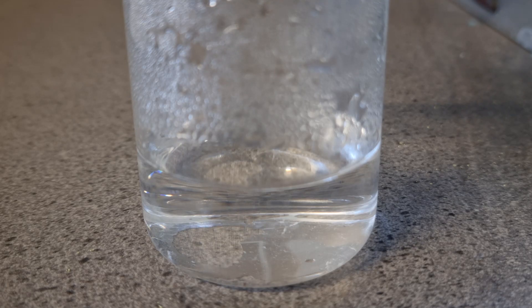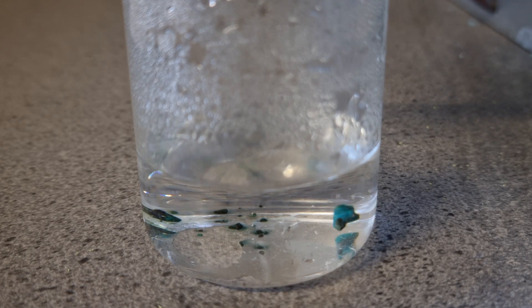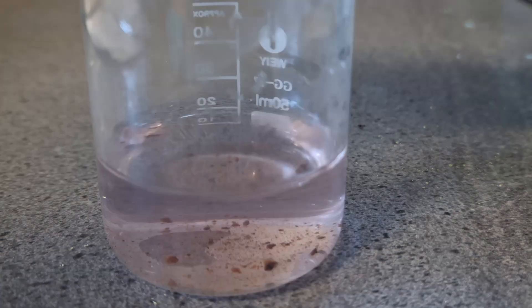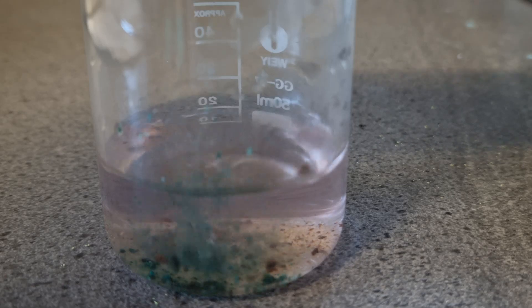Let's see what this can do. It appears relatively stable in air. When added to water, the solution has a faint pink color. Adding more turns it more towards green.